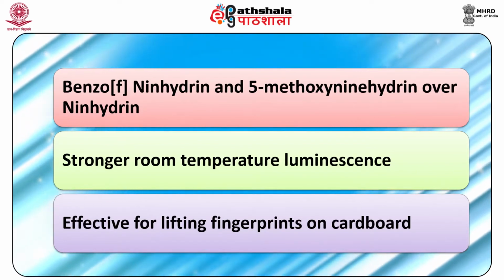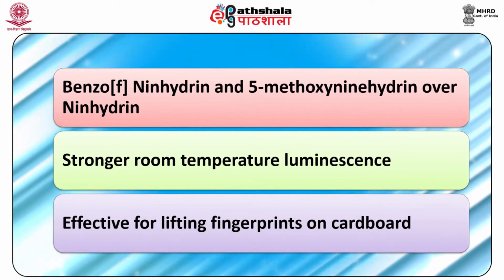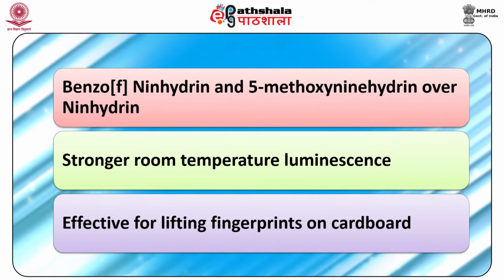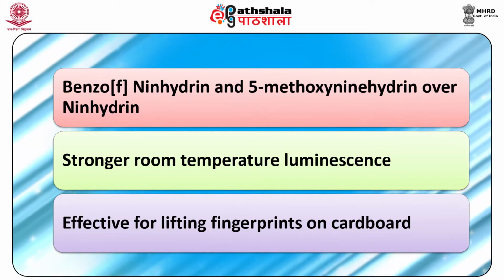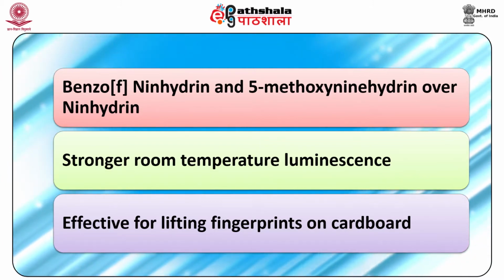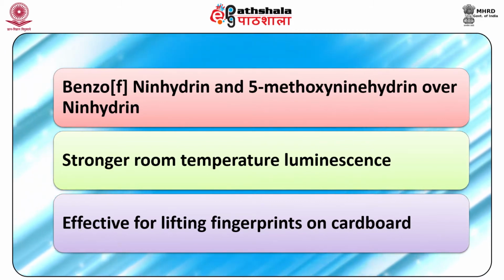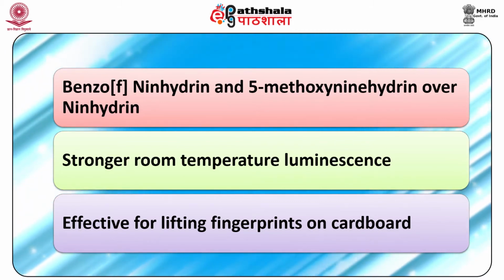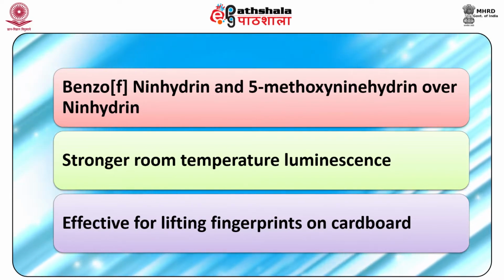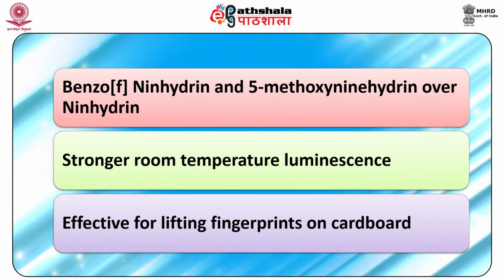Benzo-F-ninhydrin and 5-methoxy-ninhydrin offer operational advantages over ninhydrin. Prints developed with either of these reagents showed stronger room temperature luminescence after zinc chloride or cadmium chloride treatment in comparison with similar prints developed with ninhydrin alone. These were also effective in lifting fingerprints on cardboard where the background luminescence precludes the successful development of fingerprints with ninhydrin alone.